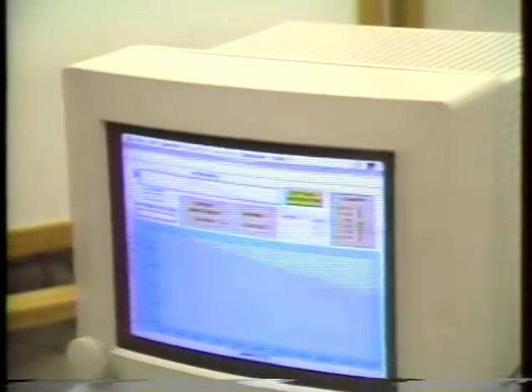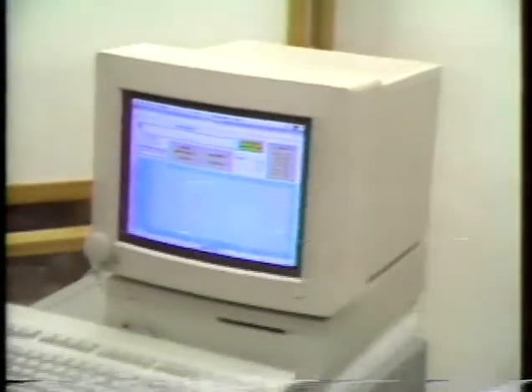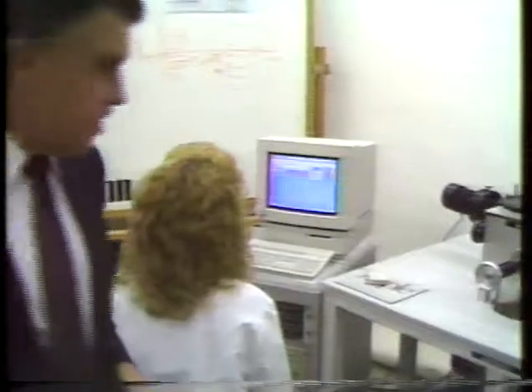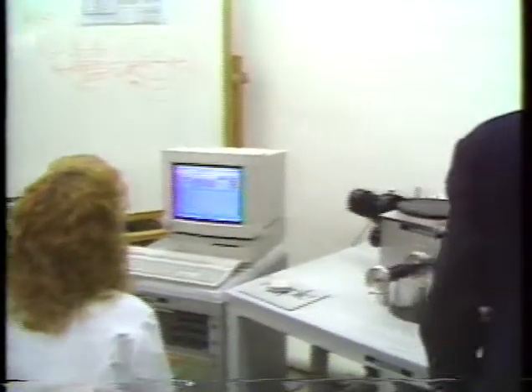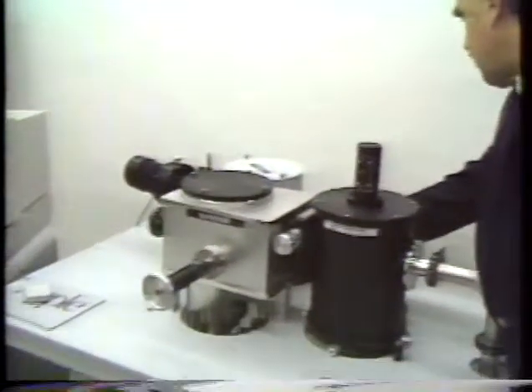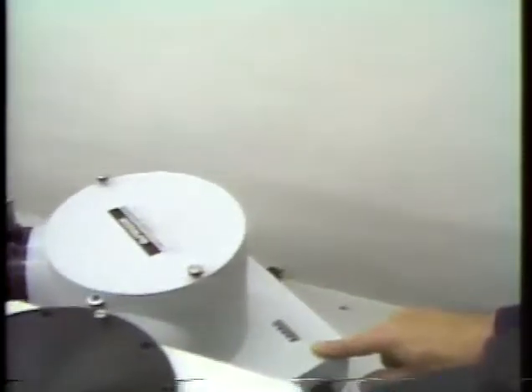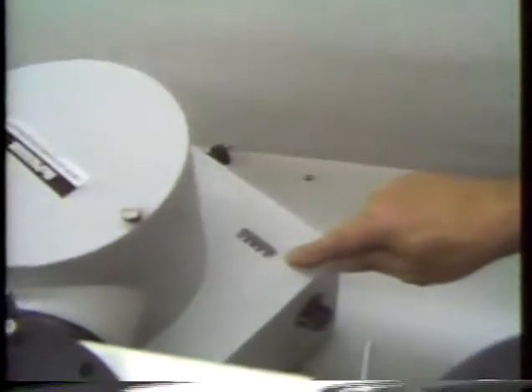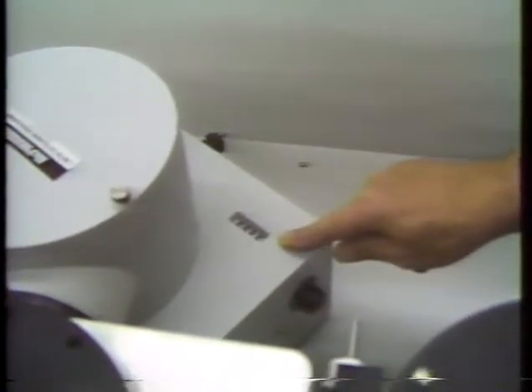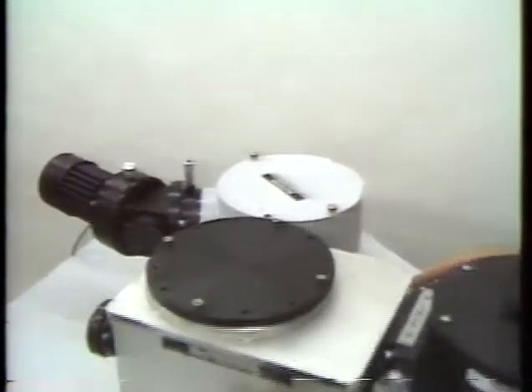Now you start to scan, and this means the monochromator will be actuated, right? And we will see the wavelength going down to 115 first, finding its starting point. It goes slightly below 115, then comes up to 115 to take the backlash up, and now it will scan in the pre-selected intervals, in this case 20 nanometers.